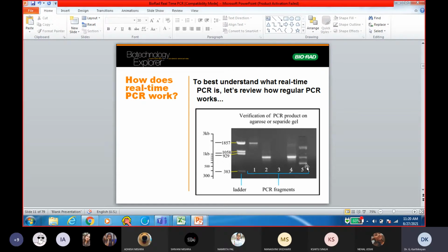Okay. There are certain enzymes, certain genes that constitute what is called a gene family, right? So sometimes when you do a PCR for such gene families, you may inadvertently amplify multiple copies. Okay. So there are principles for designing your primer so that your primer binds to only select regions so that you can have specific amplification.